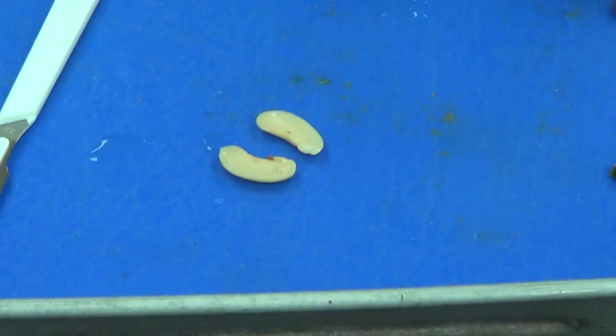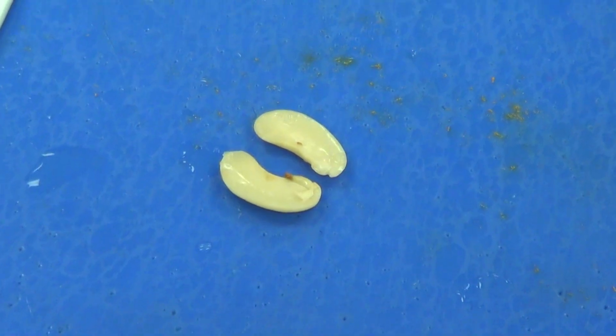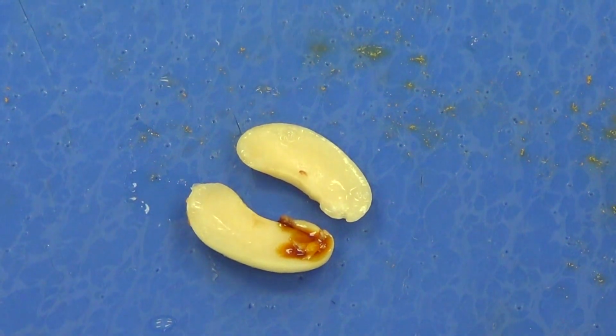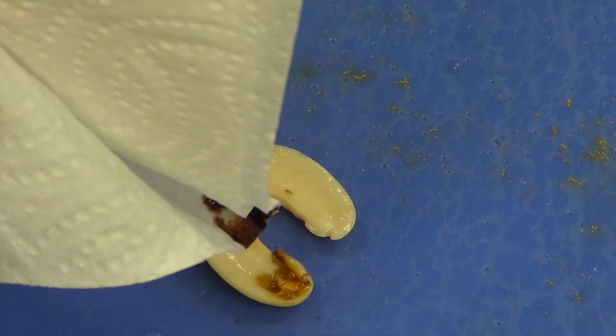Let me move some of these other parts out of the way. I'm going to dab this just a little bit. I'm going to put a little bit of iodine on here to bring out the color, just a very small amount. And I'm going to soak it up just a little bit there.